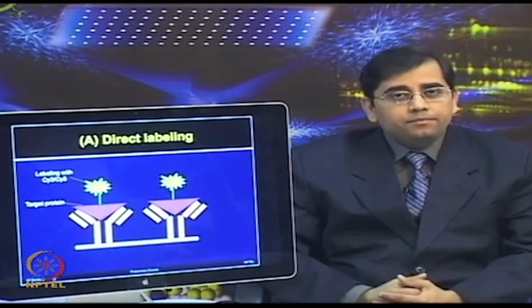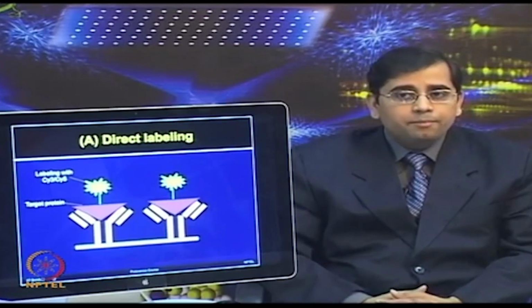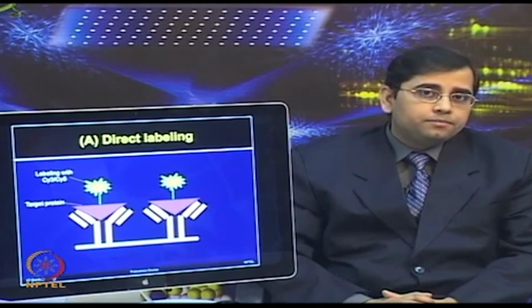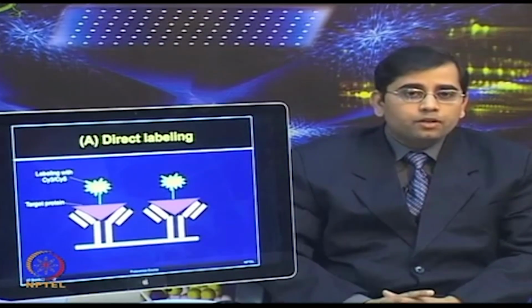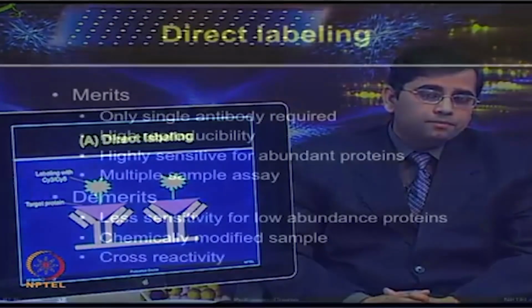Direct labeling allows the co-incubation of a reference or control sample with an analyte of interest, both containing different tags, Cy3 and Cy5, that can facilitate internal normalization.